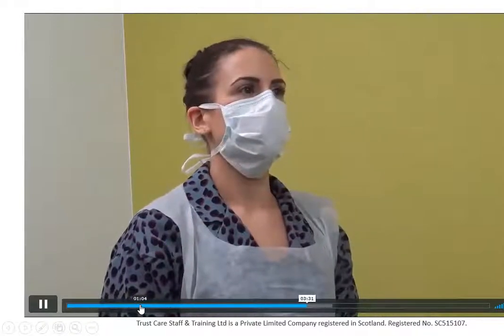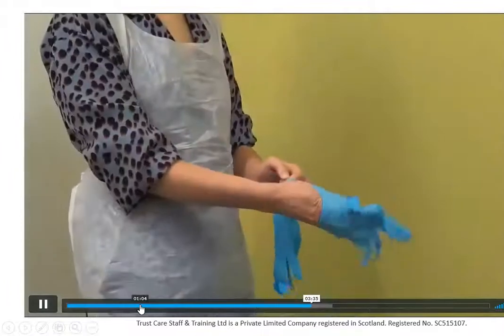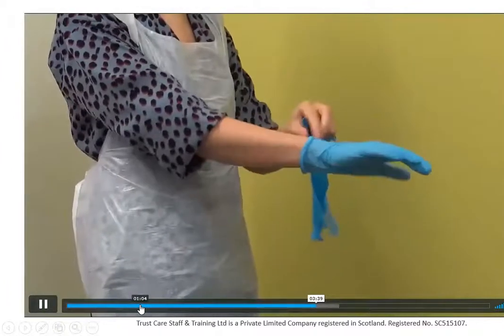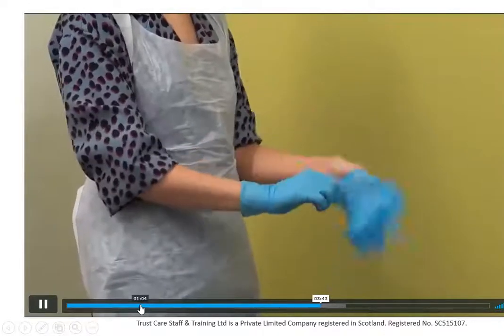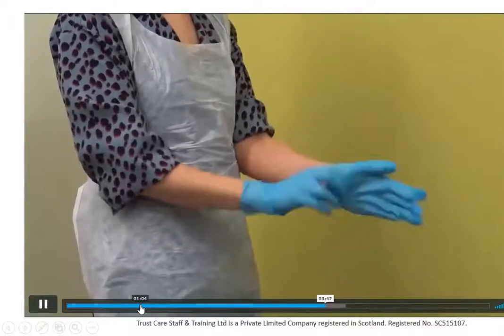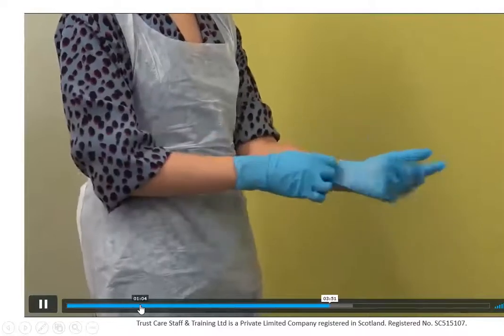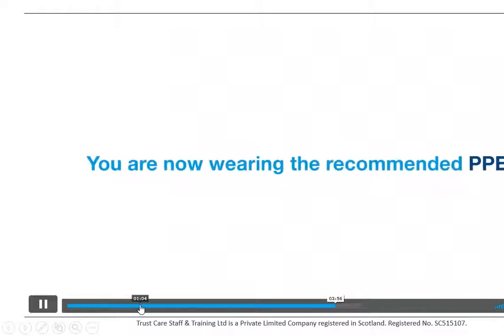There should be a little metal strip that you tighten over the nose. At this point you can touch the outside of the mask, but once you're in a room, don't touch the outside of it. You put on your gloves last when putting your PPE on. They should be well-fitting — not too flat and not too small where they might rip — and should be pulled right up over the wrist.